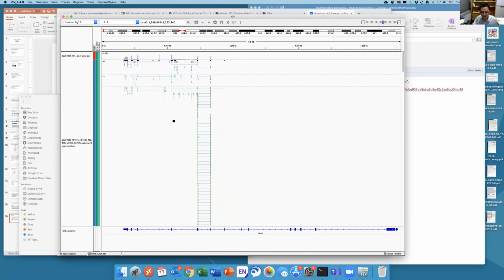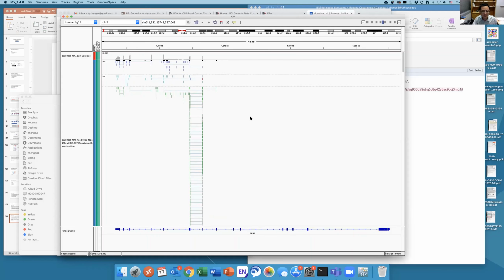This is a very interesting gene. I won't go over all the biological significance of this gene. But when you look at the reads aligned to the TERT gene, what is pretty remarkable is that the gene is on the minus strand, so the direction goes from right to left. Normally, in regular RNA sequencing, you have more reads aligned to the 3' end, but in this case the first half of this gene is remarkably clean.